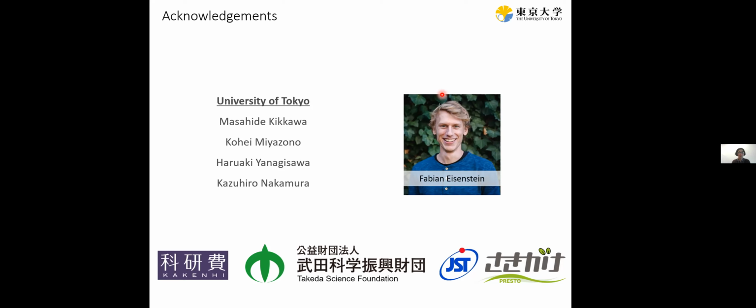Jason, did you want to ask your question or do you want me to read it for you? Yeah, I can ask a question. Thank you, Rado. It's really a fantastic talk. I think you mentioned in your previous CGRP receptor dataset, the one without G protein, the well-packed particles gave a helpful hand with the ice thickness. However, in the similar receptor-only dataset we got from your lab in Japan, which we imaged in Melbourne, we got some problems with preferred orientation of particles. I think without G protein, this receptor only prefers to show the top view instead of a mixture of top view and side view. That gives quite a big issue in the following processing. Do you have any comments or suggestions for solving this issue?